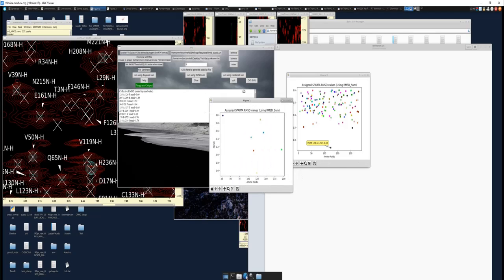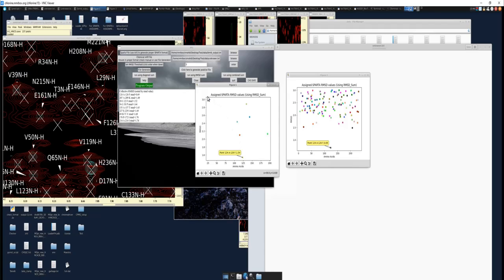Actually, I still have the Sparta Plus open. Forgot about that. So you can see here that you actually get a much better fit to the BMRB than the Sparta, the BMRB gives a much better fit, an RMSD of 0.69 compared to the Sparta Plus. But the Sparta Plus only has 7 potential matches, whereas BMRB gives you a ton more.